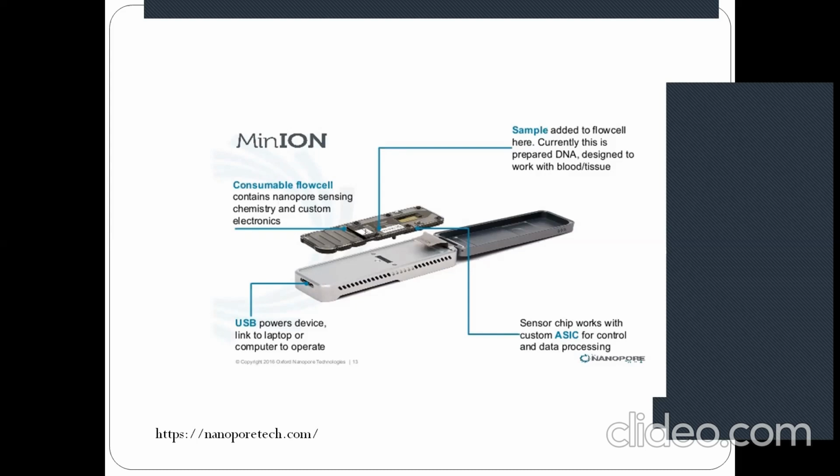Albacore is the software, or the data curation platform, because once you load your sample, maybe DNA or RNA, the system gives you the sequence in terms of nucleotides, like A, T, G, C. Once you call the data, we call it data calling or base calling. Suppose you have got A, T, G, C, C, A, G, G, whatever.